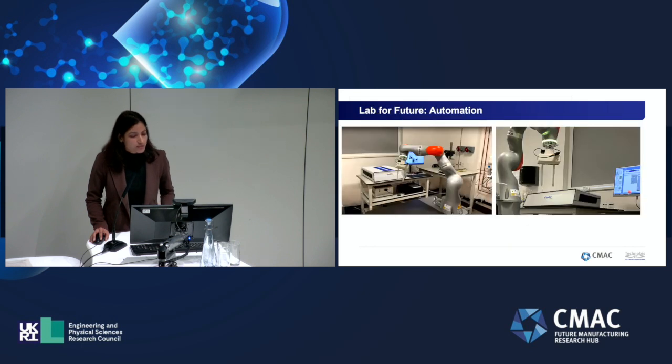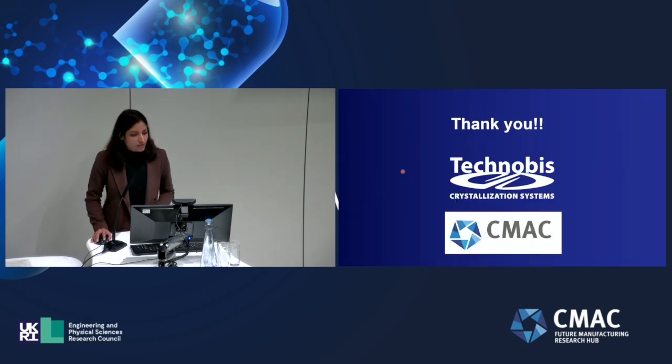I would like to end this talk by looking into collaboration with CMAC. In the last 2 days, you have seen this during the lab tour and so many presentations. And this is Crystalline with the robotic arm. Here you can automatically program the experiments, and the robotic arm can put the vials in the Crystalline, and you can work overnight, and it will quickly accelerate the translation to industries. I would like to thank CMAC for giving me this opportunity, and we look forward to more collaboration with CMAC, and I'm happy to answer any questions. Thank you.